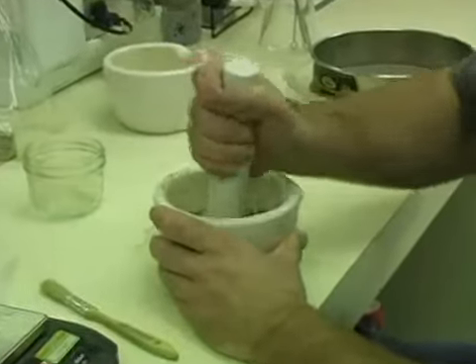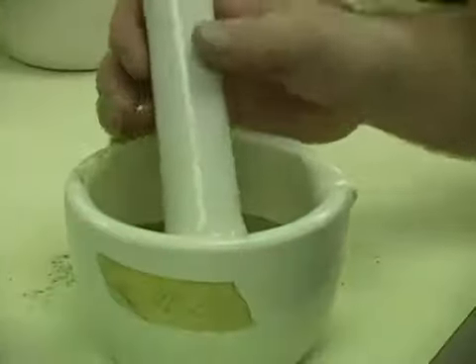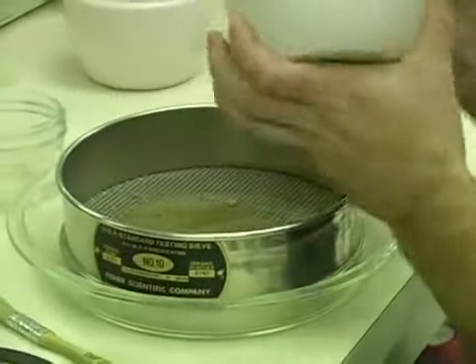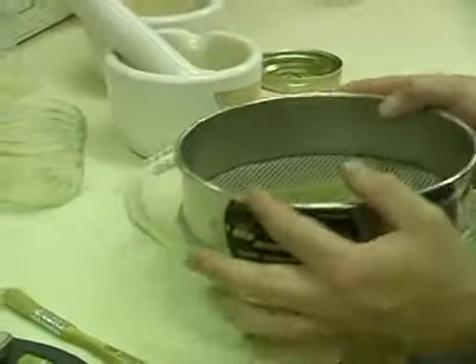Okay, we're grinding up all the soil particles and we're sieving them through this 2 millimeter sieve, and we're trying to extract all the rocks from the soil sample that we got.